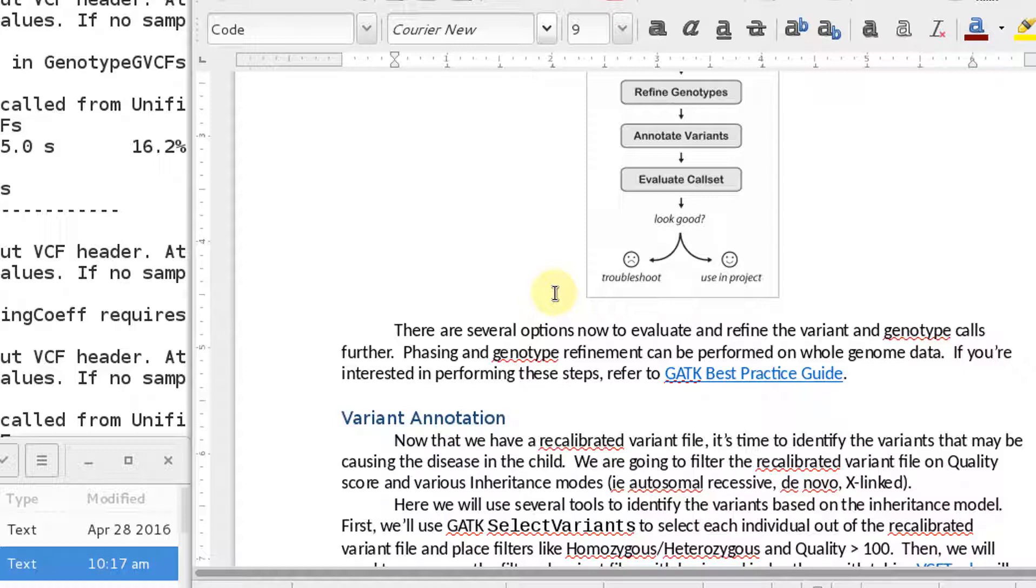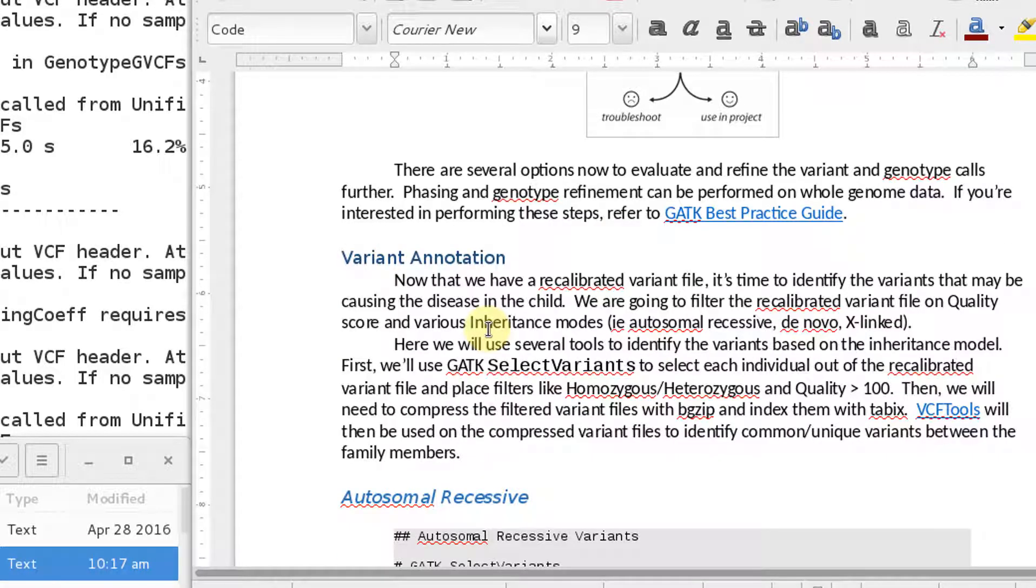Now, in my document, I have a very archaic way of extracting out from this VCF file that you just generated, pulling out information of autosomal recessive, de novo, X-linked, and so forth. There are much, much better tools out there than what I have listed here. The reason I have this very archaic set of tools, and there's some pitfalls when you run these, that you're not going to always extract out all of the autosomal recessives or all of the de novos.